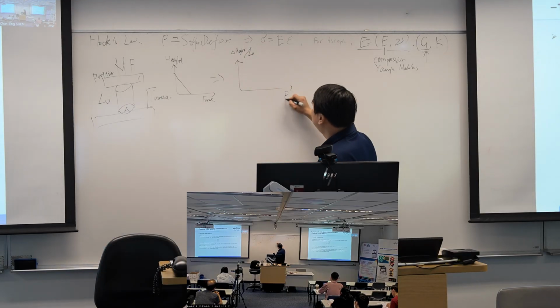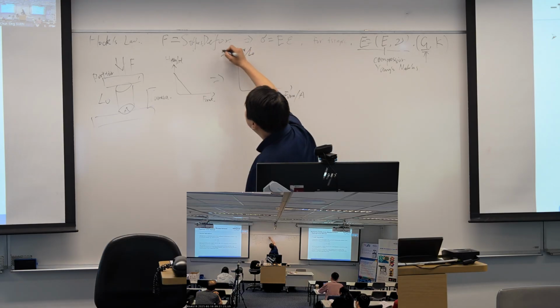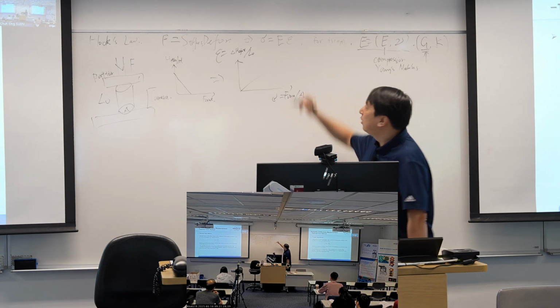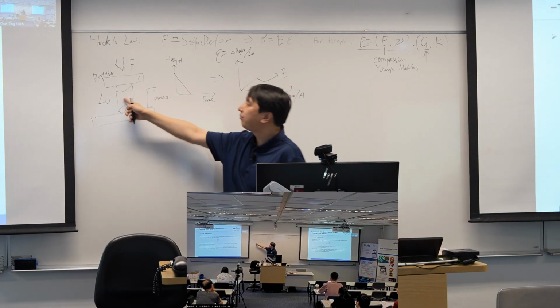And the force divided by area, which are strain and stress. Then this curve will be transferred, and the slope of this curve should be the Young's modulus of our sample.